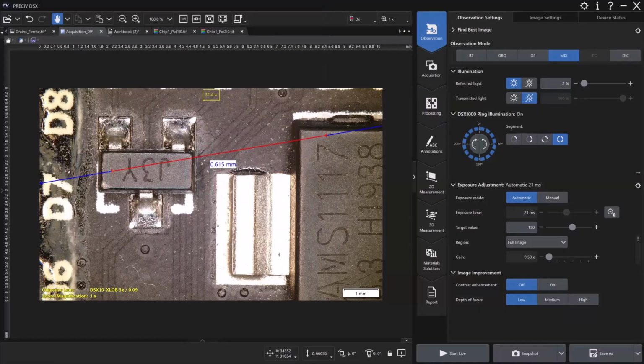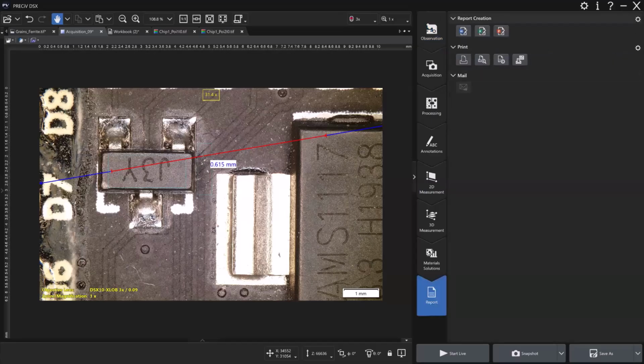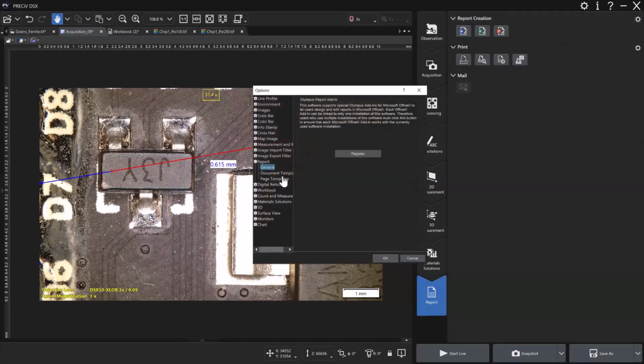Yeah, let me see if I can. Bear with me a second. Sometimes I can get. It's just not going to work on this right now. I can't quite show the report template, but they are just standard Word or Excel or PowerPoint report templates. Oh, so you create a template like Word and you're able to bring it up or whatever.